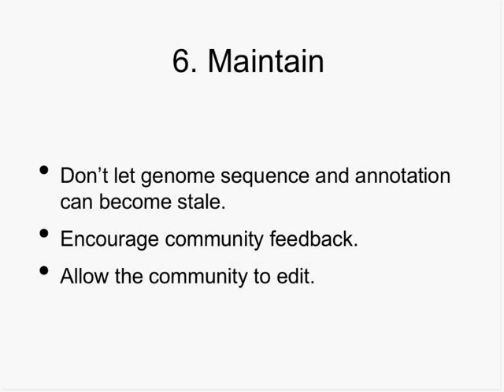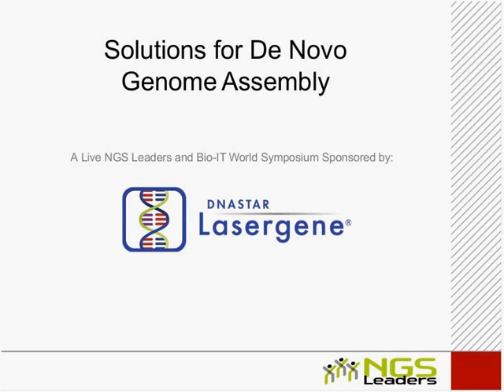I'm going to quickly slip in a couple of questions here that we had from the audience while you were speaking. This will be common knowledge to many of the people in the audience, but what did you mean by N50? N50 is a measure for what an assembly looks like.